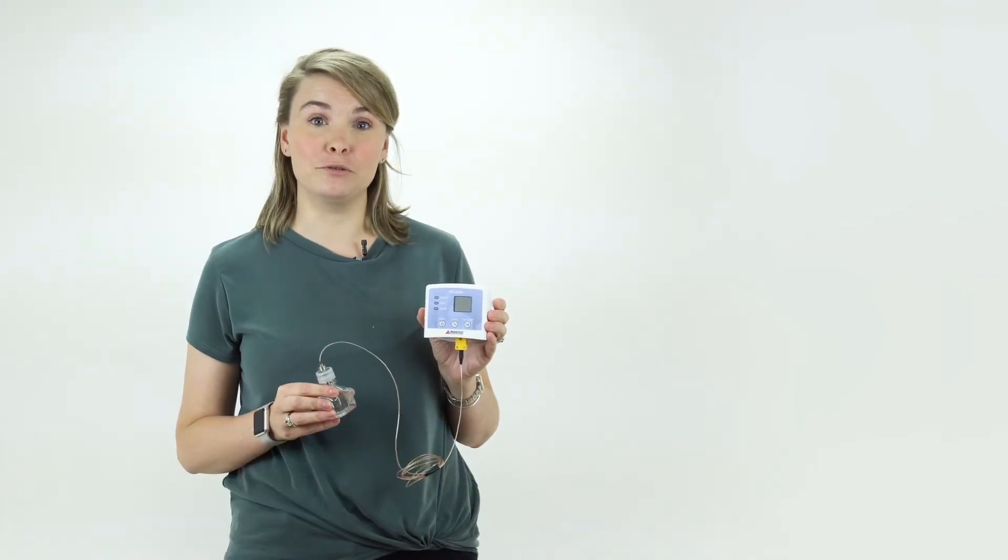Hi everyone, my name is Meredith and today we're talking about the VFC-2000. The VFC-2000 is a low-cost vaccine temperature monitoring solution.